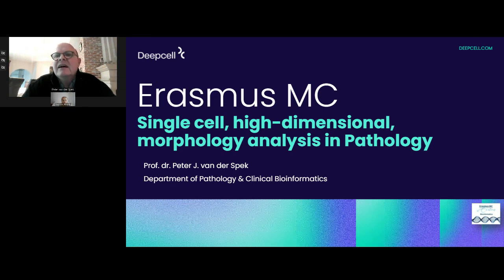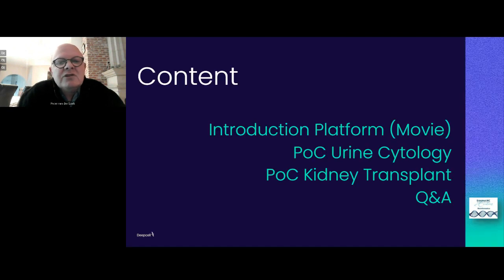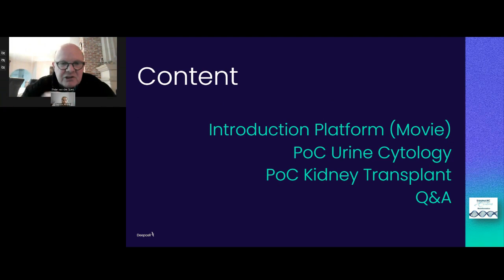We have had the opportunity to work for a period of 5 weeks with the very impressive REM-I machine from the company Deep Cell. First I'm going to give an introduction to the platform, then outline 2 of the studies that we have been doing in detail, and then there will be space for questions and answers.